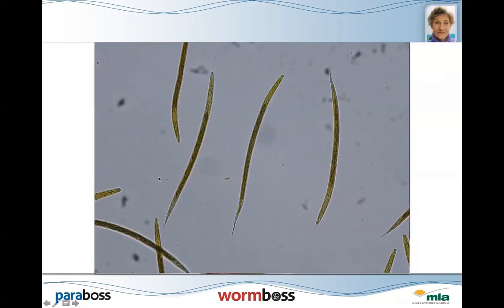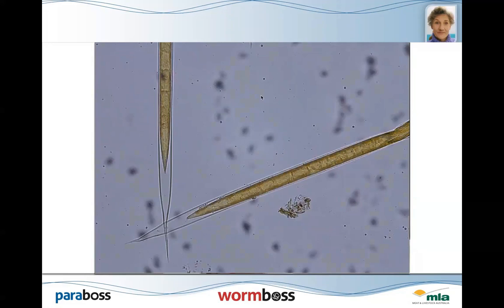Now, I can't tell you, this requires considerable expertise that I certainly haven't got, but based on looking at tails and heads and other parts of the larvae, the people in the lab can actually tell you what species they are, and then they can do a percentage of the count based on which ones they're seeing. This one here actually has a black scour worm, I believe, and a Barber's pole worm in it, but I can't tell the difference. I haven't got that expertise, and that's why you send it to a lab.